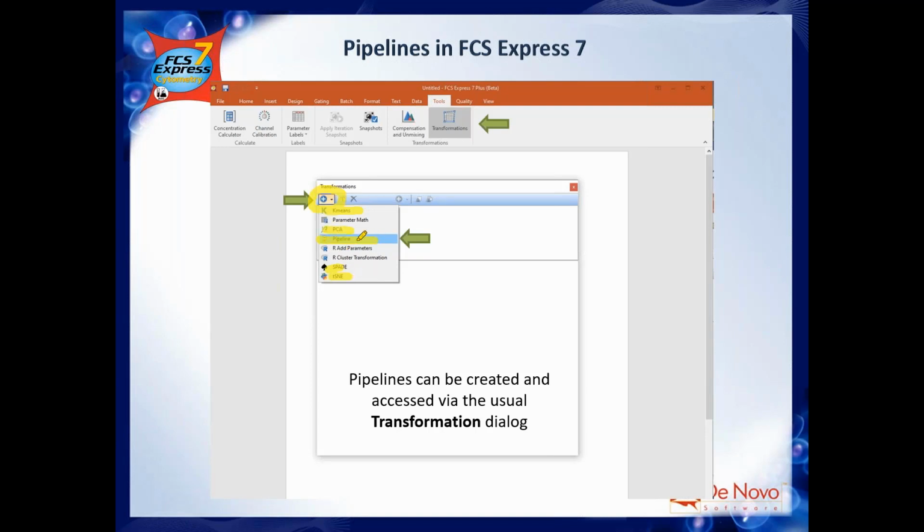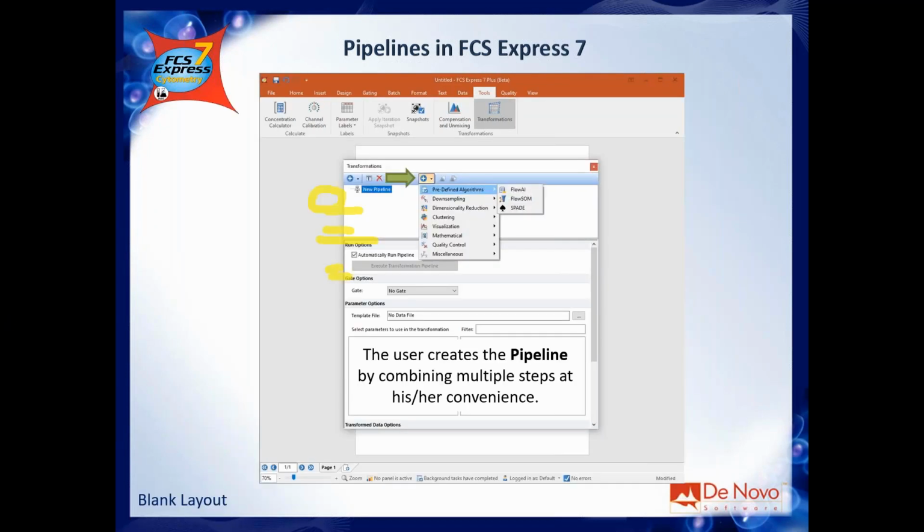Nowadays, people will always run a pipeline, okay? So this is why we are here today. And once you create the pipeline, you will be able to start adding steps, okay? And this is done by clicking on this other little plus. We have about, I will say, like 40, 50 steps. So we are going to add more steps based on your feedback.